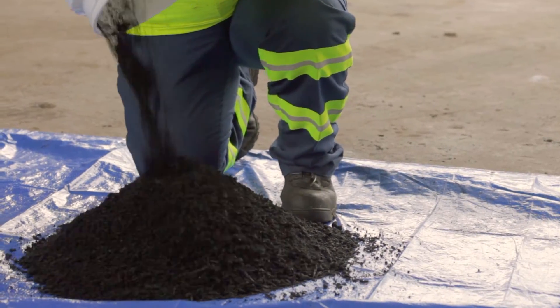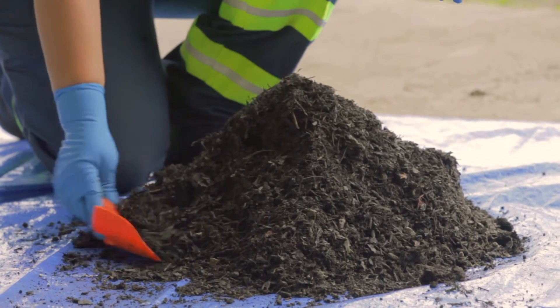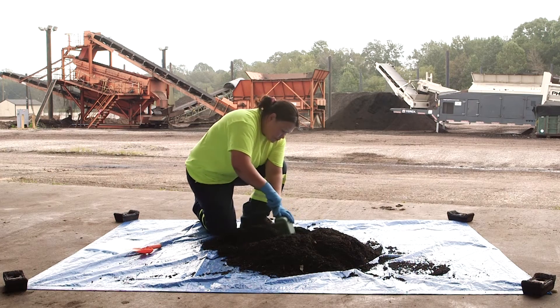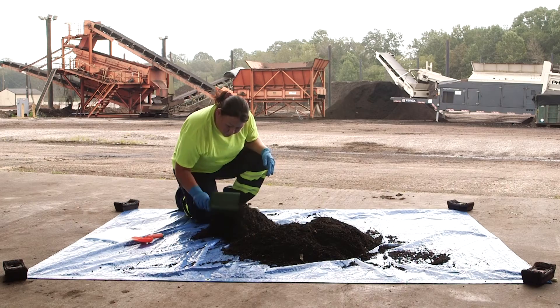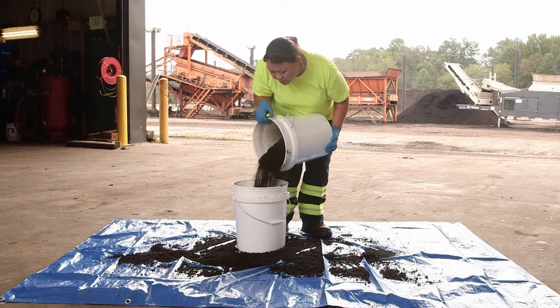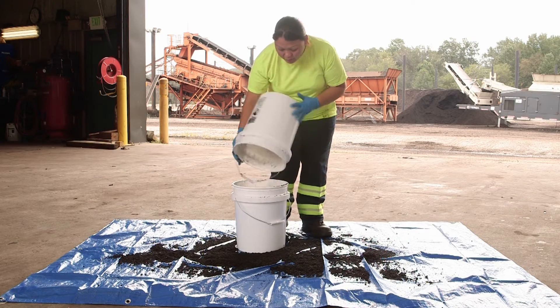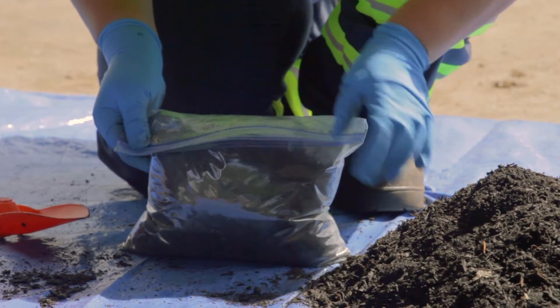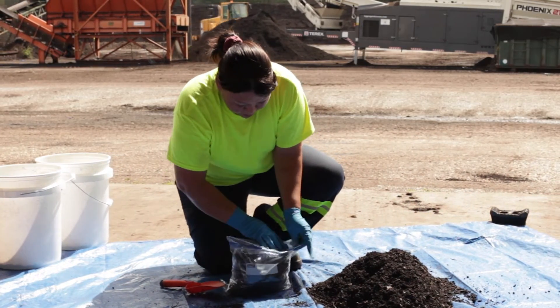In order to make a representative composite sample, the subsamples must be thoroughly blended. If weather conditions are extreme — for example, high precipitation or high wind — choose an area under cover for making the composite sample. Empty the subsamples from the five-gallon bucket onto the tarp and use the plastic hand trowel to thoroughly blend all of the subsamples together. The cone and quarter method is helpful for further randomization: randomly cut out one-fourth of the blended material and further blend this portion, repeating until you have approximately one gallon for shipping. Alternatively, after blending on the tarp, the composite sample can be tumbled and tossed from one five-gallon bucket to a second bucket, breaking up clumps by hand while wearing nitrile gloves. Place approximately three and a half quarts of the thoroughly blended composite sample into the pre-labeled Ziploc bag, and remove excess air before zipping. Then place this bag inside a second Ziploc bag for additional sample protection.